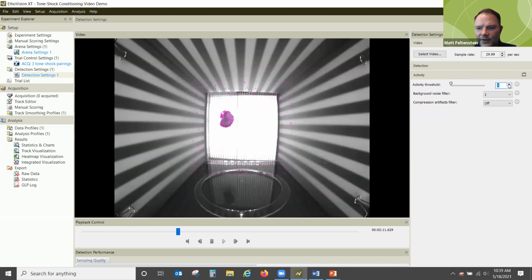What I recommend for fear conditioning, and a lot of people ask me, do I need to put an animal in to get my activity settings to work correctly? My answer is really no, you don't have to. It may be hard to see here, but if you look on the edge here, you see some random purple pixels. I'm in the mindset, you want a little bit of background noise. Animal just got a shock. We saw the animal move around the cage like crazy.